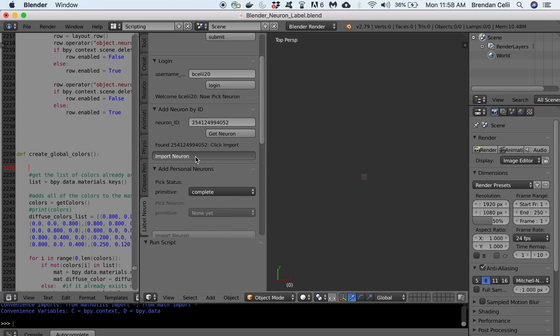All right, this is another long step. It's doing a lot of things behind the scenes. Just be patient. Okay, and there we go.